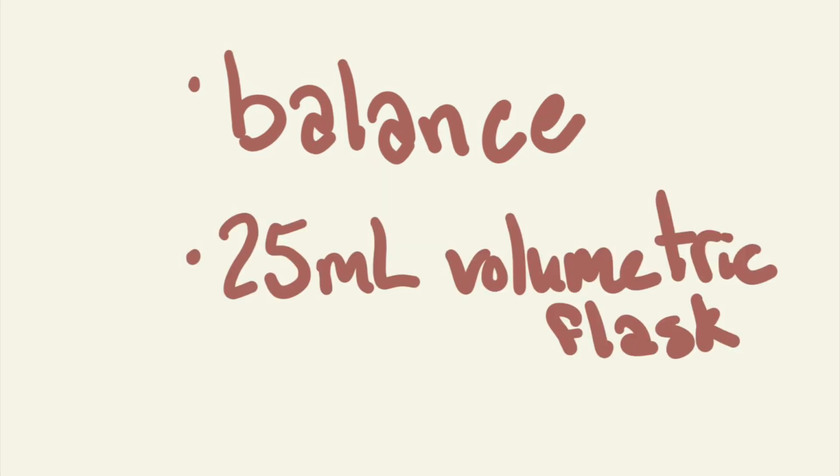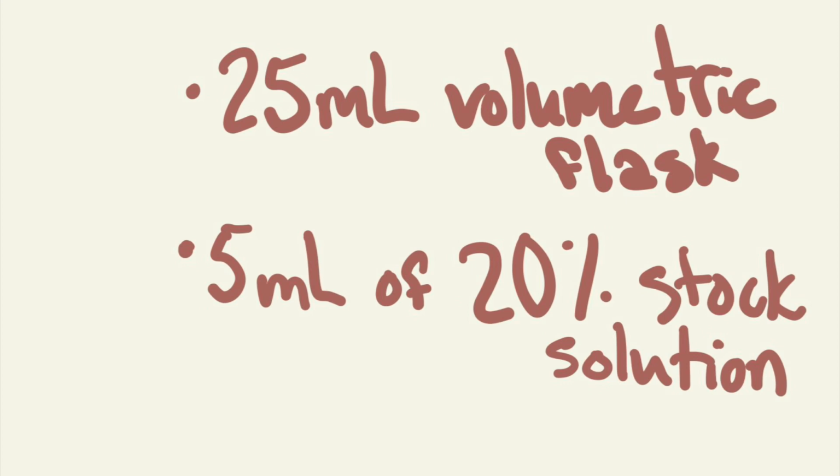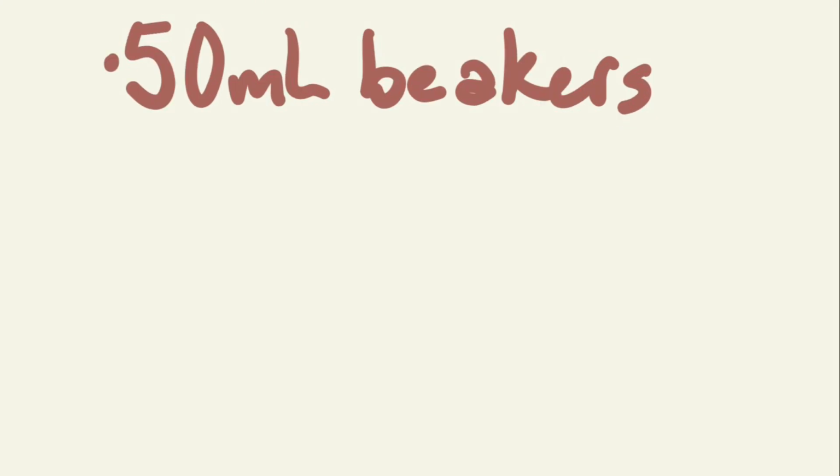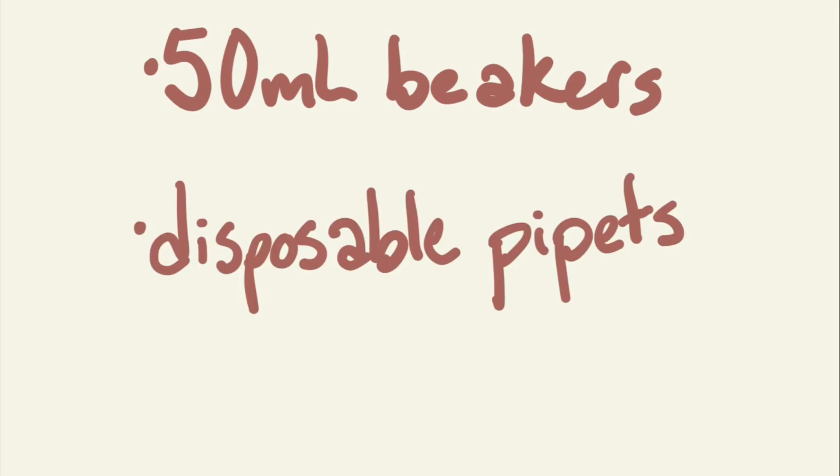The materials we will need for this lab include a balance, a 25 milliliter volumetric flask, 5 milliliters of the 20% stock solution, a beaker of water, 50 milliliter beakers, disposable pipettes, and a graduated pipette.